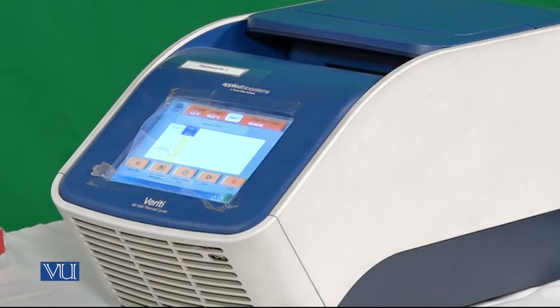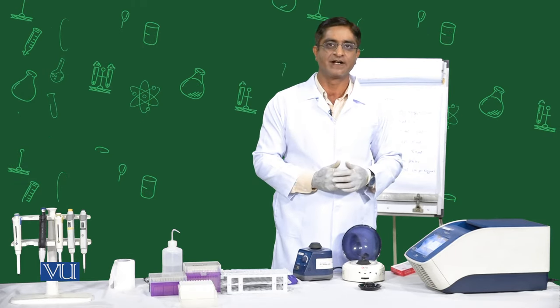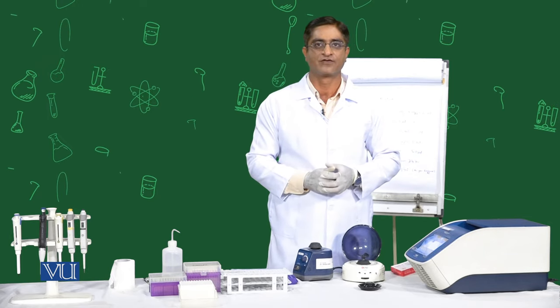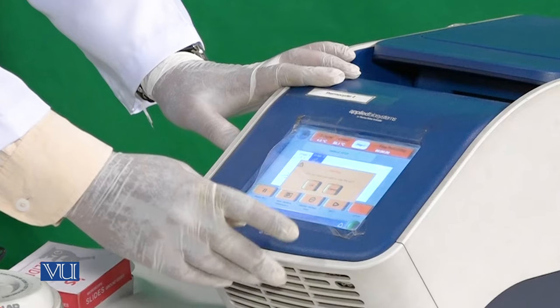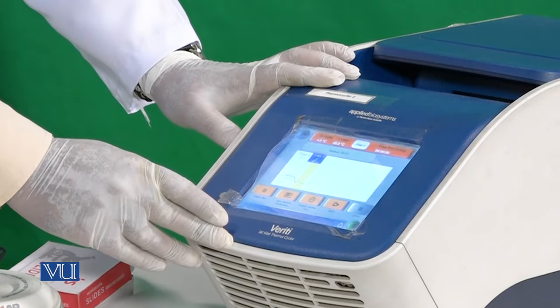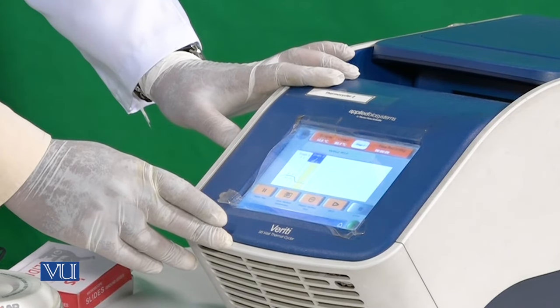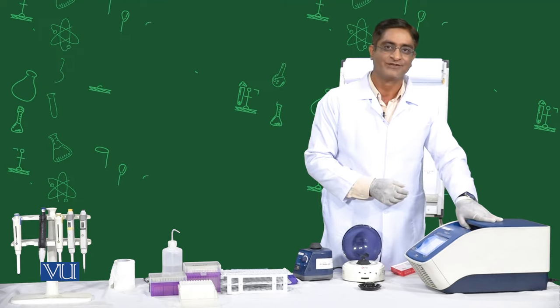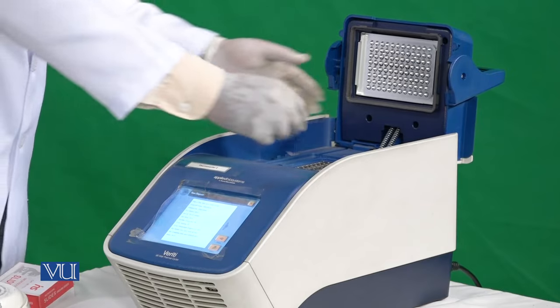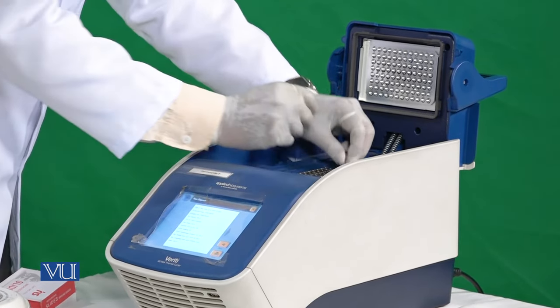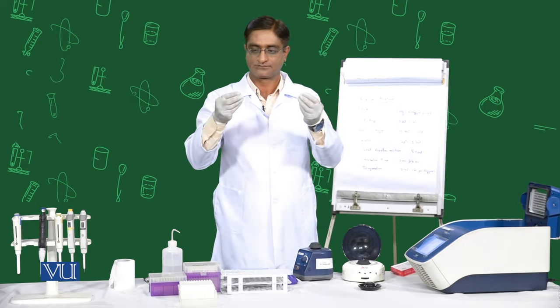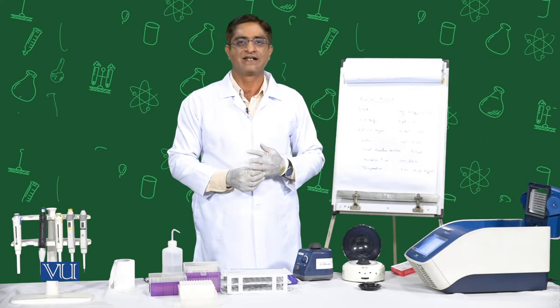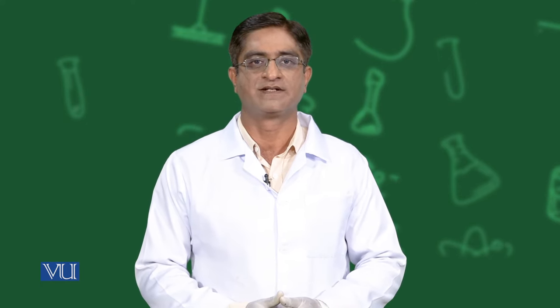Our reaction is completed after 60 minutes and the samples are stored automatically at 4 degrees centigrade by the thermocycler. Now we will take out our tubes and proceed to gel electrophoresis. For the gel electrophoresis procedure, please see the gel electrophoresis practical video.